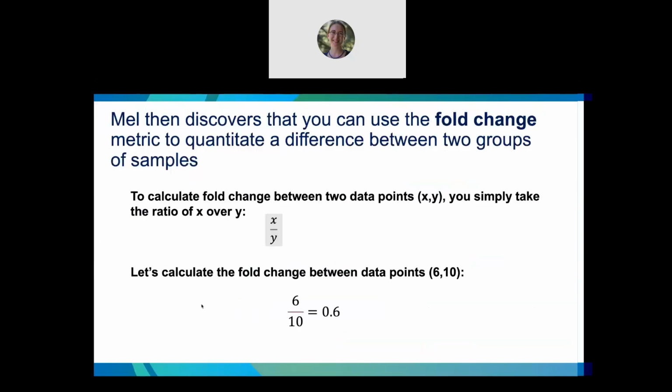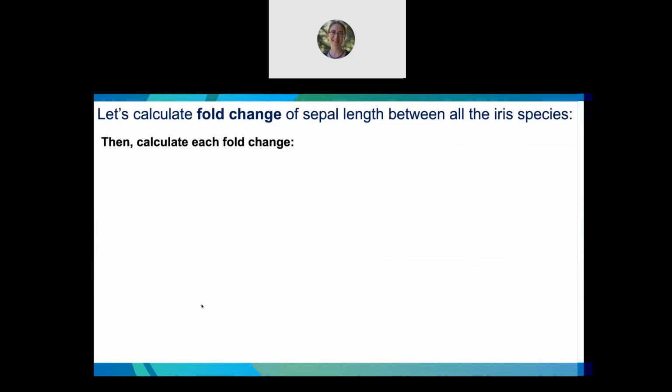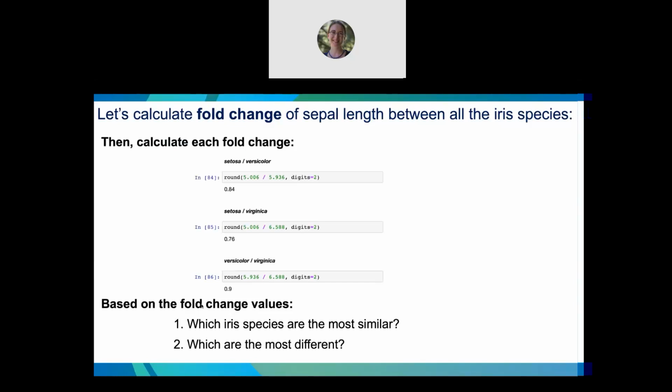So there are ways to do that. That is one of the reasons why I did all the different pairwise comparisons here. If we take all of these data together, we've described every single comparison that we could possibly want to do. So Setosa versus the other two, versicolor versus the other two, Virginica versus the other two, yeah.